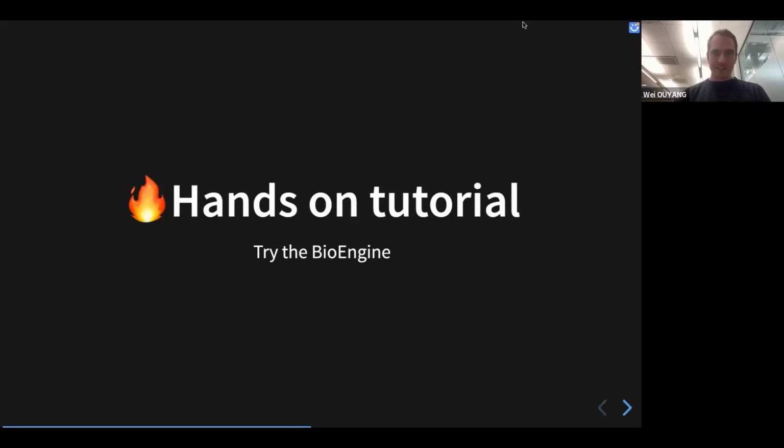Right. So, okay. Hello, everyone. So yeah, I'm just going to walk you through the tutorial. Partly that's because I only recently did this tutorial myself. So this is a refresher for me as well as being something hopefully new for you.